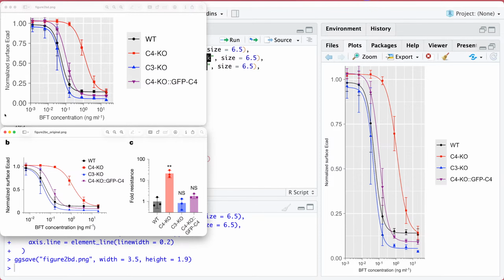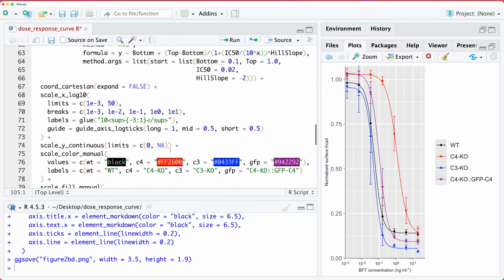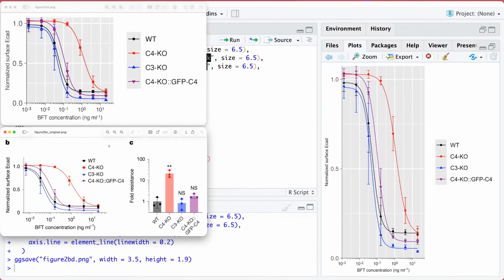And so now you can see we've got 0 and 1. Noticing theirs has just the 0.5 as the only intermediate value. So let's do that. So let's do breaks 0, 0.5, and 1. Right? So we've got that.